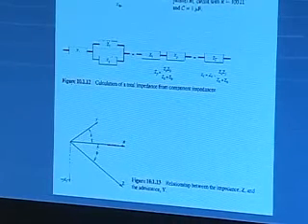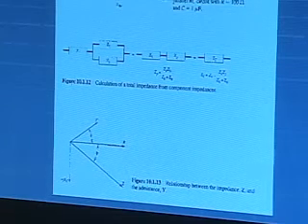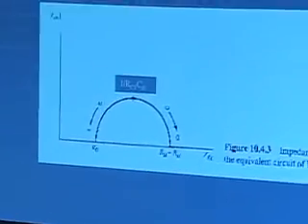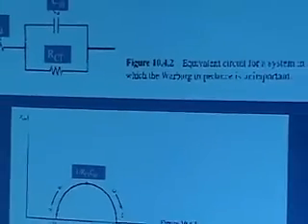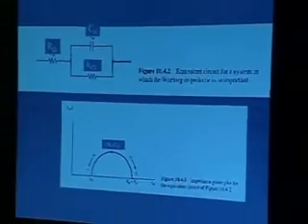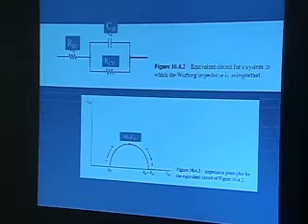Okay, what are we going to do? So you end up with a semicircle. So what? What do you do with it? That is, on a good day, you end up with a semicircle. What are you going to do with it? The way this is analyzed, and this is the whole plus and the minus of doing this, is you need to draw out an equivalent circuit. And you analyze the response of that equivalent circuit to this system.